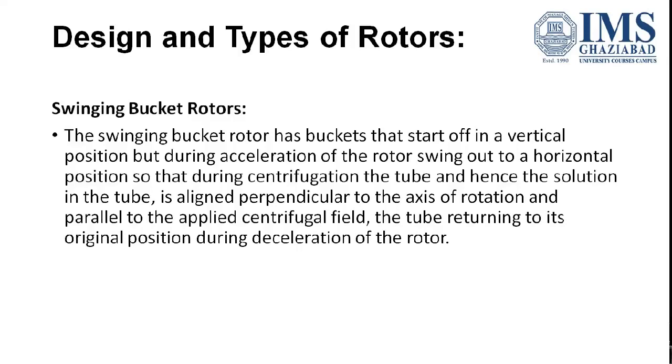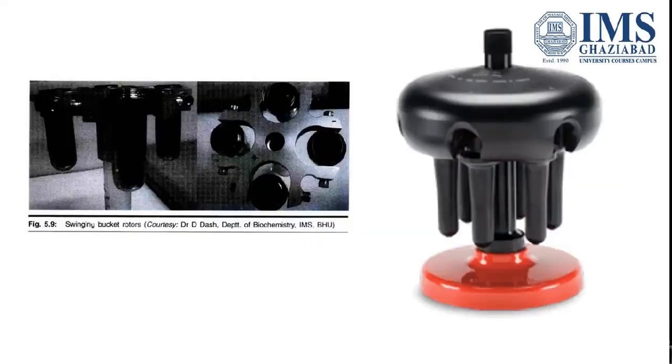so that during centrifugation, the tube and the solution is aligned perpendicular to the axis of rotation and parallel to the applied centrifugal field. Now, as there is a deceleration of the rotor, that tube returns back to its original position. This is a typical swinging bucket rotor.